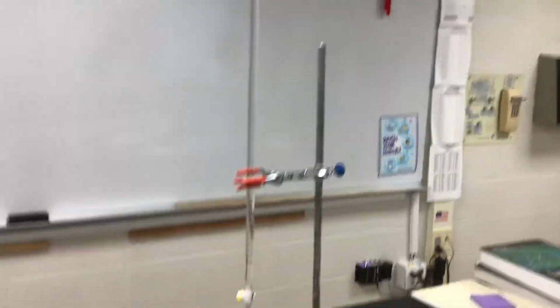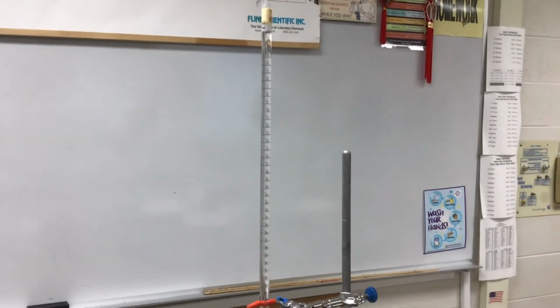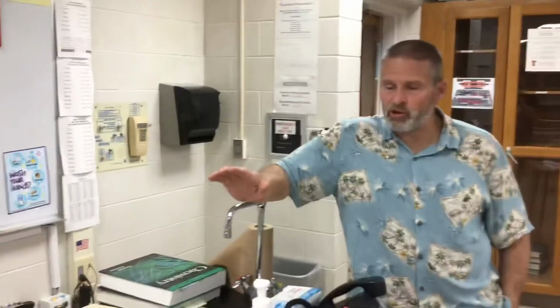It's a kinetics lab, which is fitting because Chem AP goes by really fast. And so what better than to study the rate for our very last lab. It's pretty simple. We just simply have water in the Buret. There's no chemical reaction here. What we're studying is the rate at which water is draining out of the Buret. You can treat the volume of water as if it were a concentration, if that helps you think of it more easily.